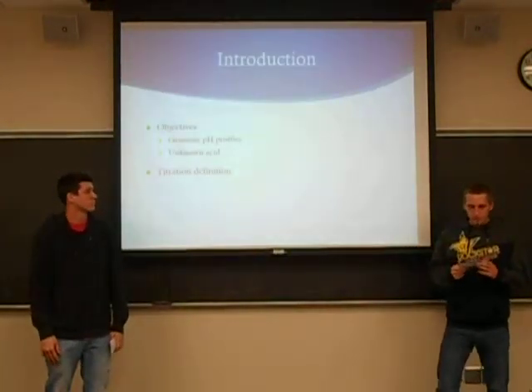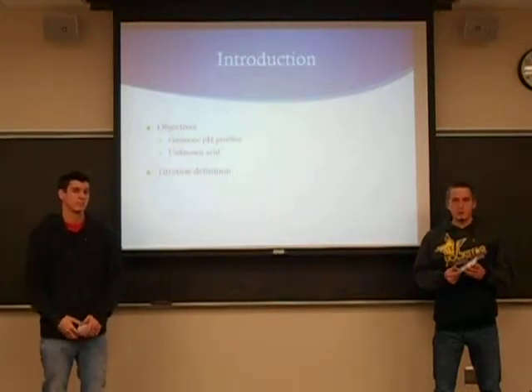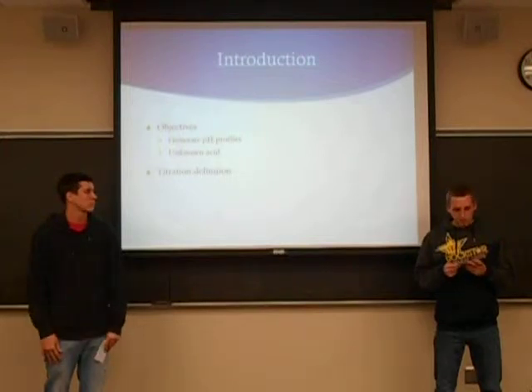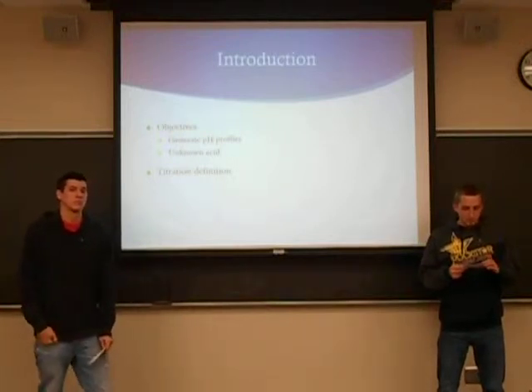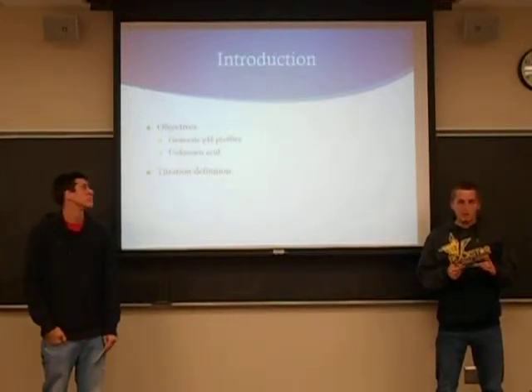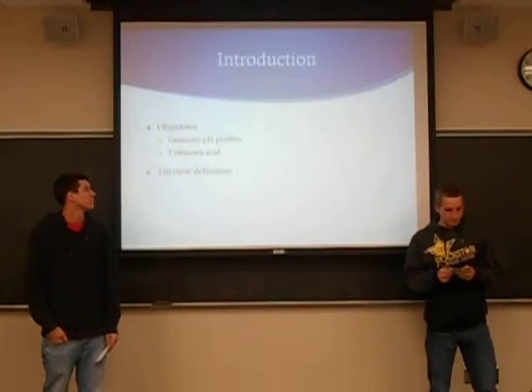A little introduction. Our objective was to generate the pH profiles for strong acids and weak acids with a strong base. And the pH profile is a graph showing the change in pH of a strong or weak acid when a strong base is added. And for an unknown acid, we were to determine the pKa, Ka, and the molecular weight of an unknown weak acid.